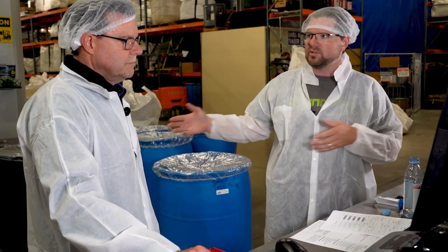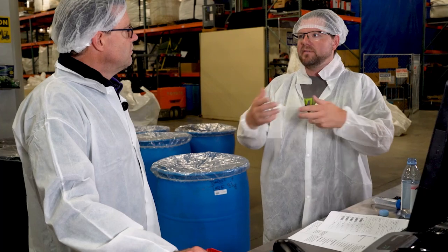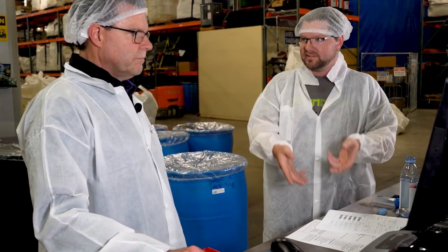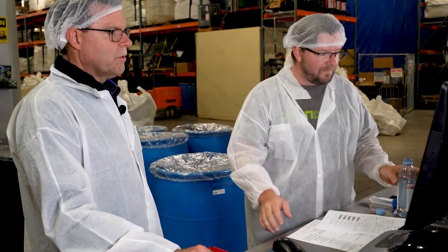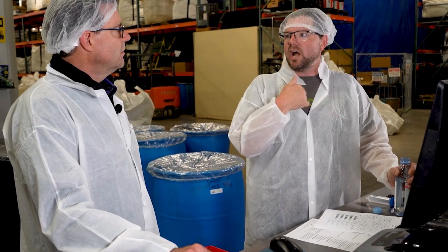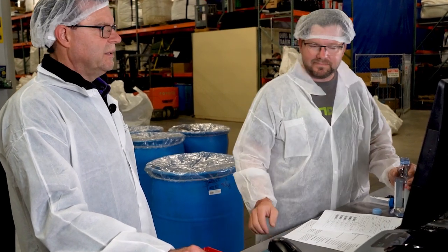So maybe 3 days or 2 days to get them all done. But you can suspend the process and then modify it, add the results to it, and redo the certificate of analysis. Once that's done, it'll show up as being done by QC. And also, that email that I put in the sampling station, I get an email back saying, hey, your analysis is done. So that's pretty sweet. Okay, then you can move on.